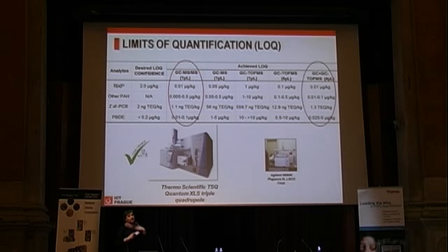And at the end, I want to conclude with the statement that we were able to introduce a new sample prep method. You can read about monitoring on GC-MS/MS and how it improved our approach. This is what we will continue with.